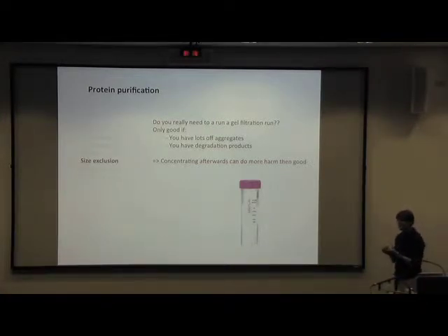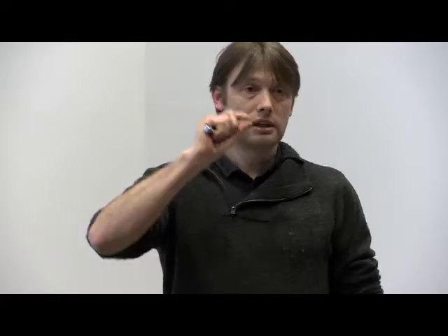And I've seen proteins indeed that once they've been through the concentrator and we went a bit too far, we could never monomerize them again. They were completely destroyed. On an SDS gel, they look beautiful. But in real life, they're actually completely messed up.